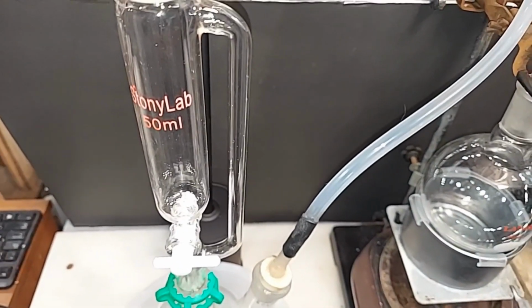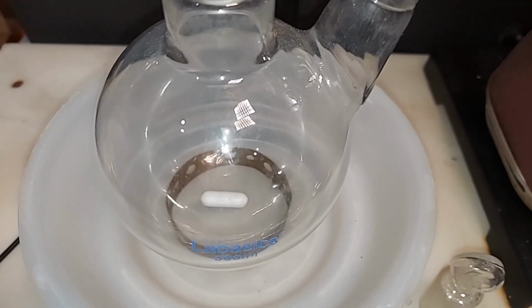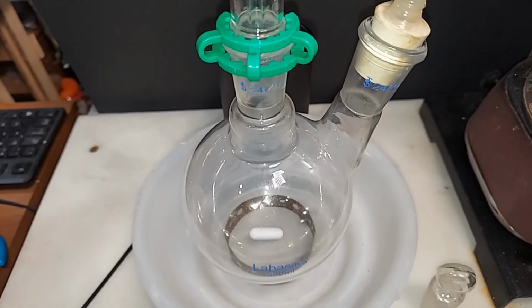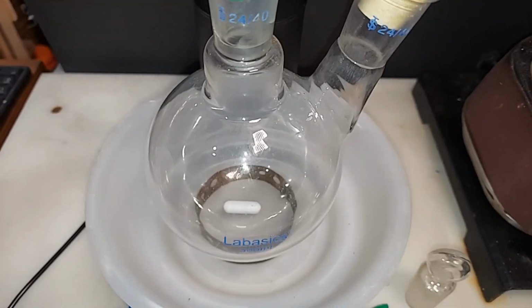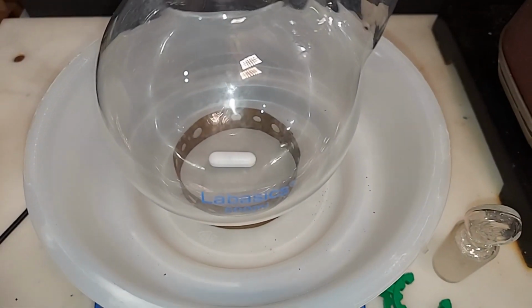I'm going to go over the glassware setup real quick. On the bottom here, we have a 500 milliliter round bottom flask that the sulfuric acid and potassium dichromate are going to be put into very slowly while it's mixing, with gases escaping through that tube there. And you'll notice that is tied to the top of that other metal bar right there, which will go up the fume hood. So if you can't get this under the fume hood, then divert the gases. On the top here is where the 40 milliliters of methanol will go, and that will drip down also extremely slowly because everything is exothermic. It'll be mixed, obviously, while this is happening.